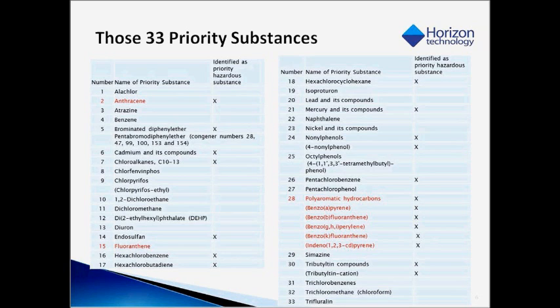These analysis methods for PAH are on those 5 polyaromatic hydrocarbons in number 28, plus number 2 and number 15, so a total of 7 PAH.